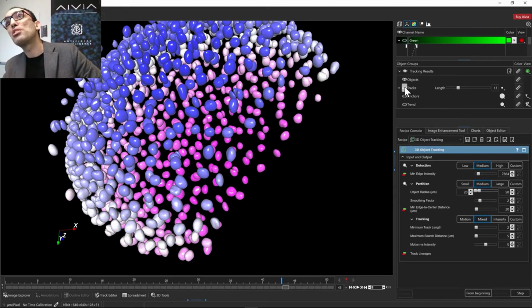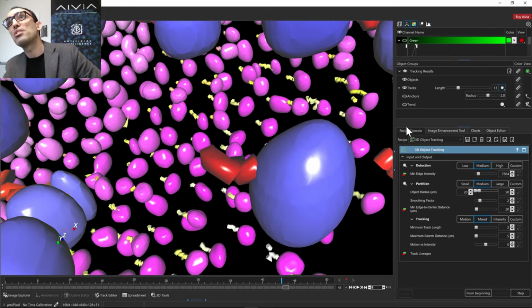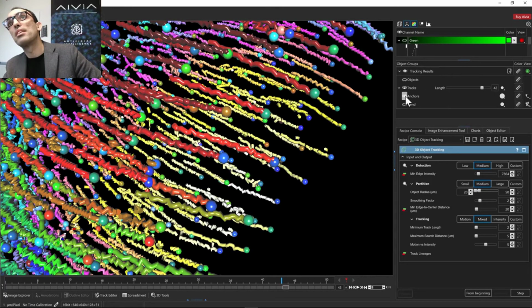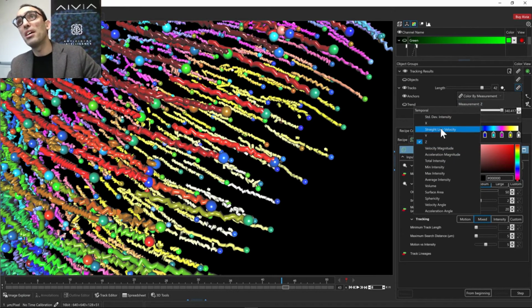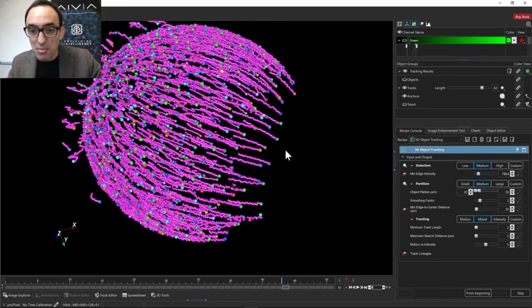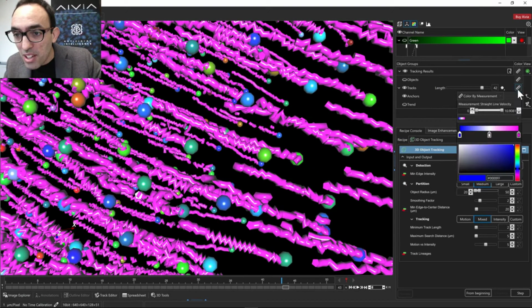And you can do the same thing to the tracks. I zoom in a little bit and make them a little bit more chunky. Okay, so they're a little bit more chunky, and I can make them also longer. So they are the tracks. And the tracks are currently color-coded for Z, actually. I'll just do straight line velocity and adjust here the color that I'm interested in. Okay, so they have pretty similar straight line velocity, so that doesn't help much.